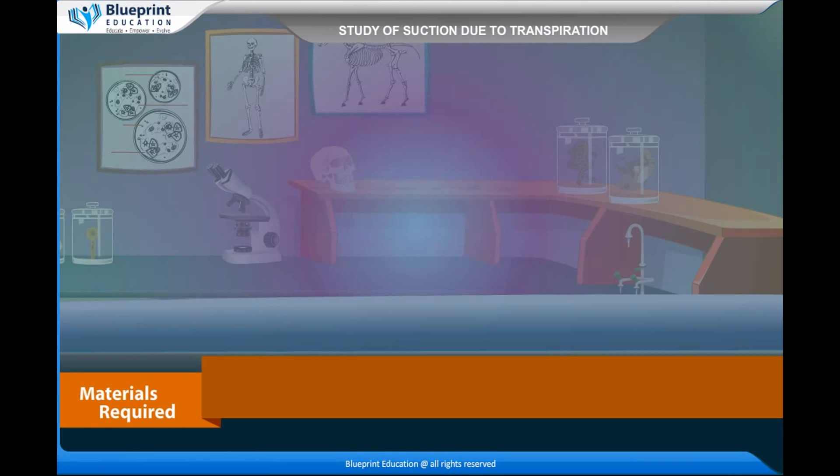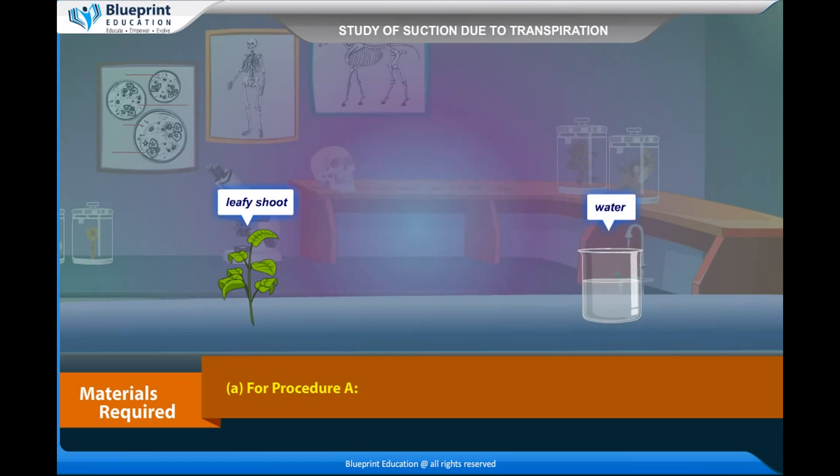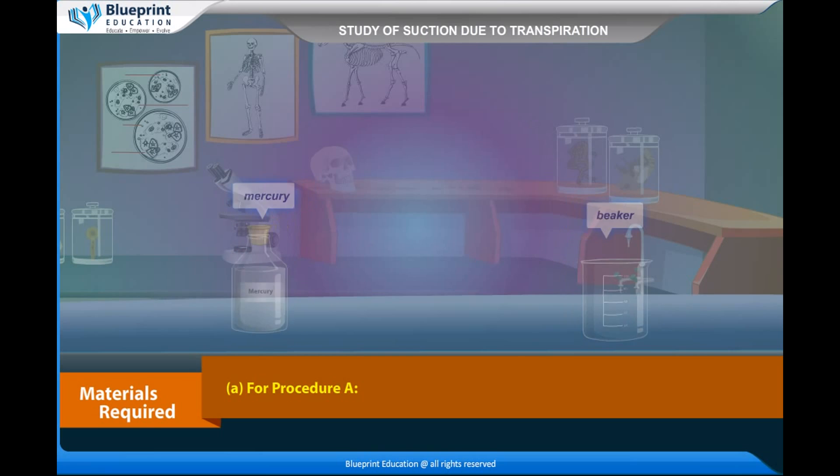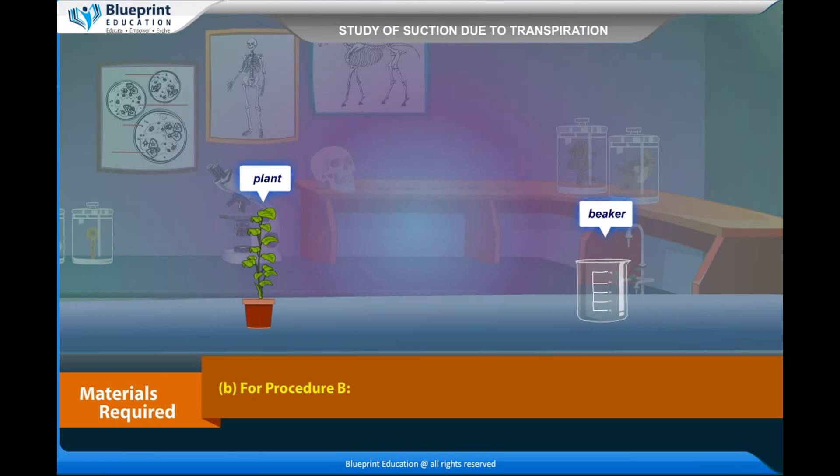The materials required are — for Procedure A: a long glass tube, rubber tube, leafy shoot, water, mercury, beaker, and rubber. For Procedure B: Ganong's potometer, water, plant, and beaker.